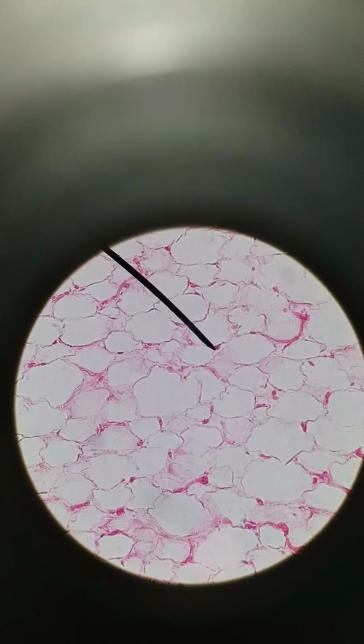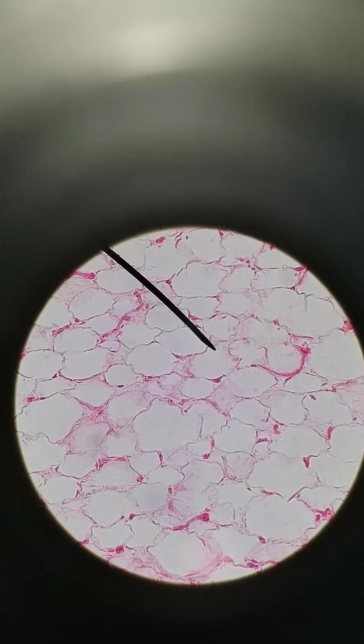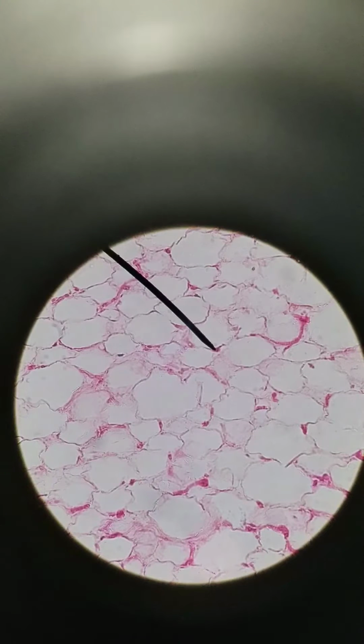The main purpose of an adipocyte is to store adipose, and we need that for cushion, for energy storage, fat storage. So they kind of look like little rings. Like this is the plasma membrane, a ring, and then the part where the nucleus and organelles are, that's like where the diamond or whatever kind of jewel is.